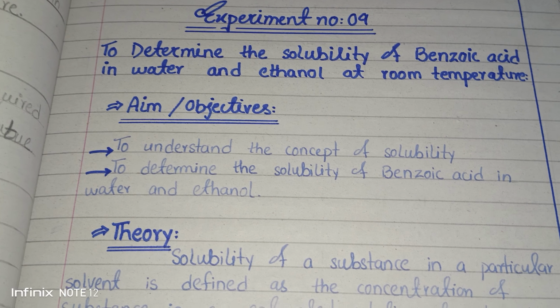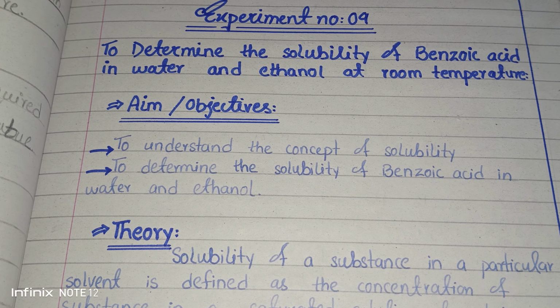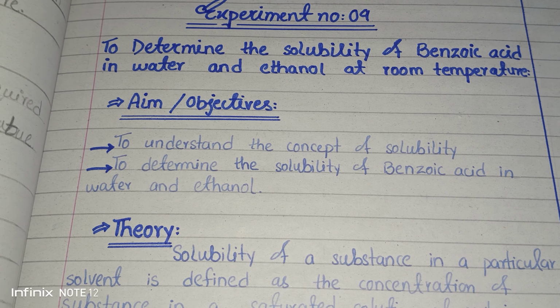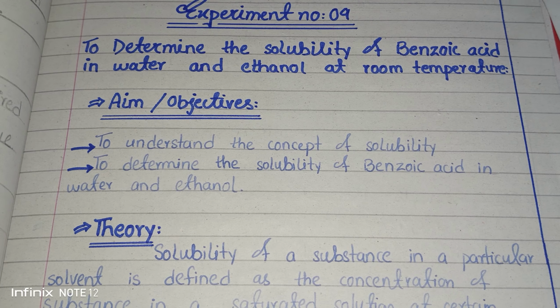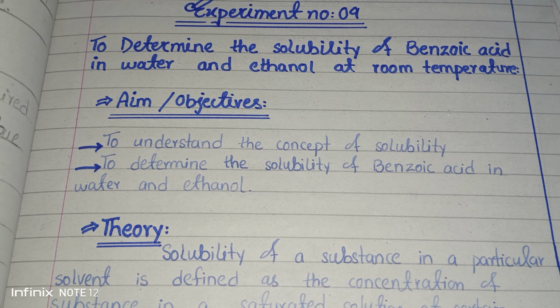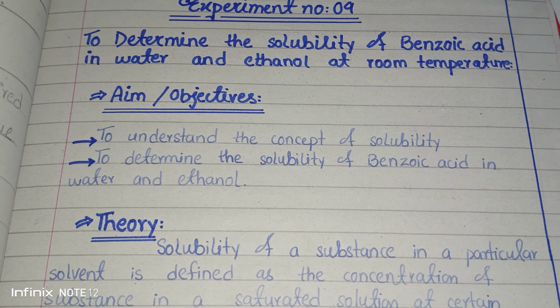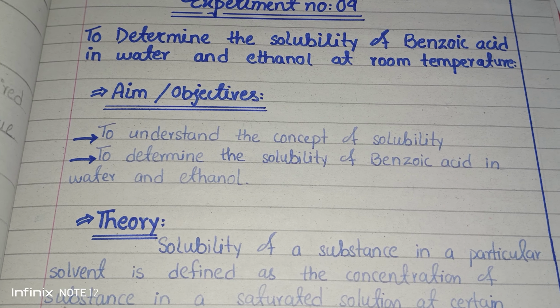Assalamualaikum everyone. In today's video, we are going to discuss another important biochemistry practical, and this is experiment number 9. The name of this practical is to determine the solubility of benzoic acid in water as well as in ethanol, which is our solvent, at room temperature.